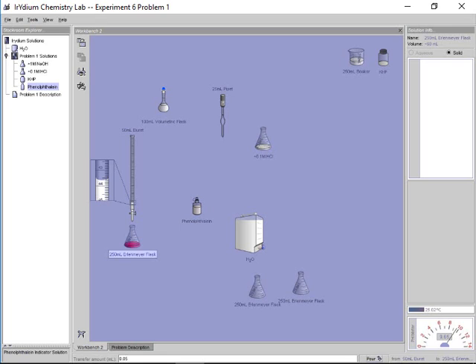I'm looking at about 43.65 plus or minus 0.05. So the total volume that I needed, let's see, 43.65 minus 11.22. I actually needed 32.43, and that's actually the number I'm going to use for my titration.